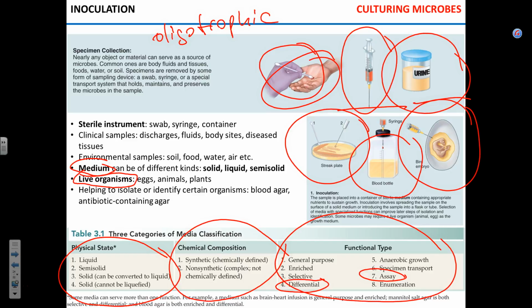And we're going to do that lab. It's pretty interesting. So a numerical code that you can then take to a special catalog and look up this code in the catalog, and identify what you had as your inoculum. And usually it works pretty well. It allows you to identify it very, very closely. So that's going to be an assay. Okay? Did I answer?